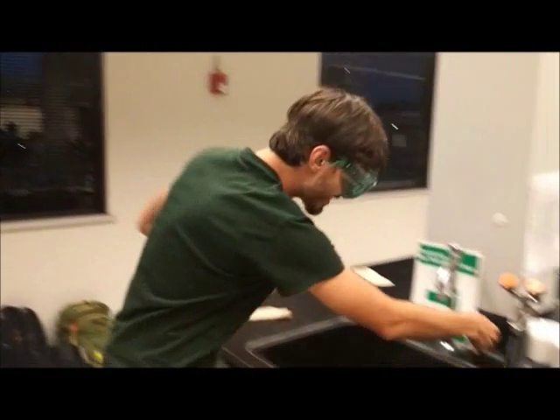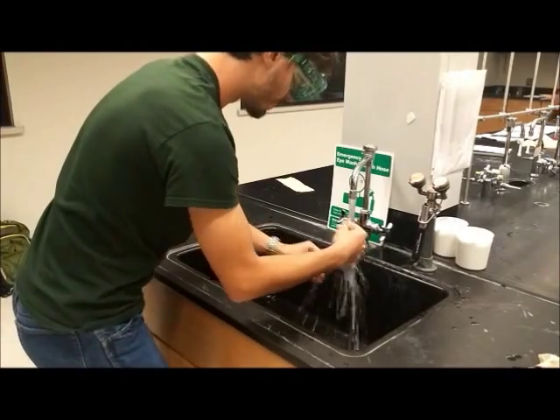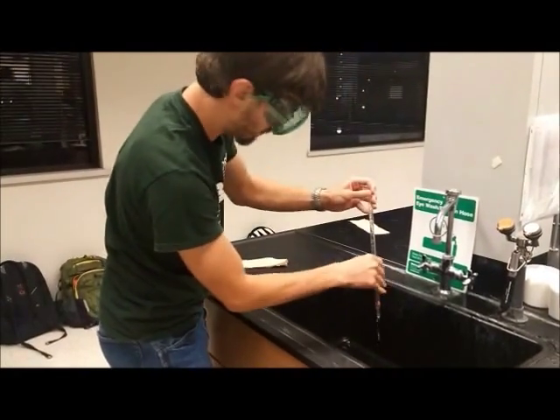Before using a pipette, it is important to clean it. This step is called priming. First, clean the pipette 3 times with water. After that, clean it 3 times with whatever solution you're working with.